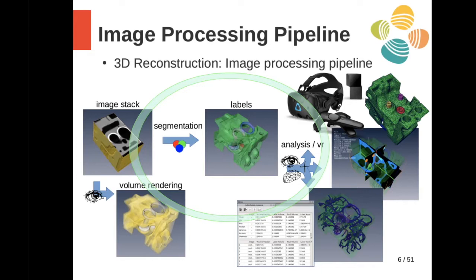But the volume rendering route is more for qualitative analysis, when you want to see what's there and get a sense of things. But if you want quantitative analysis, that's where the segmentation route comes in. And that's what we're going to explore now.